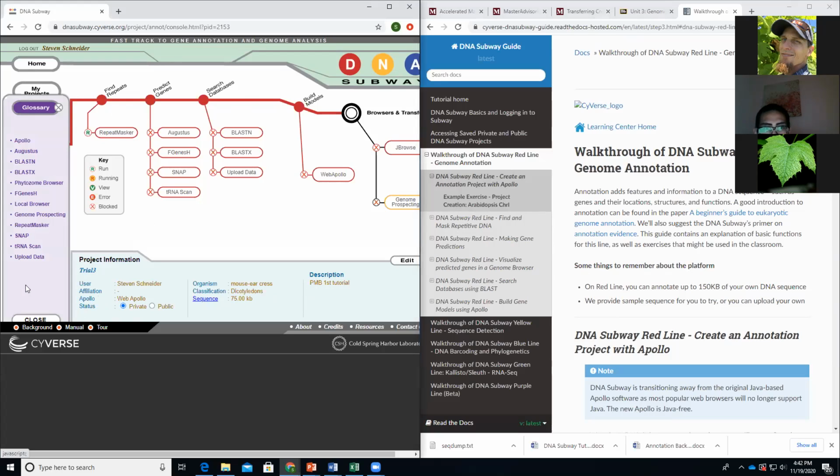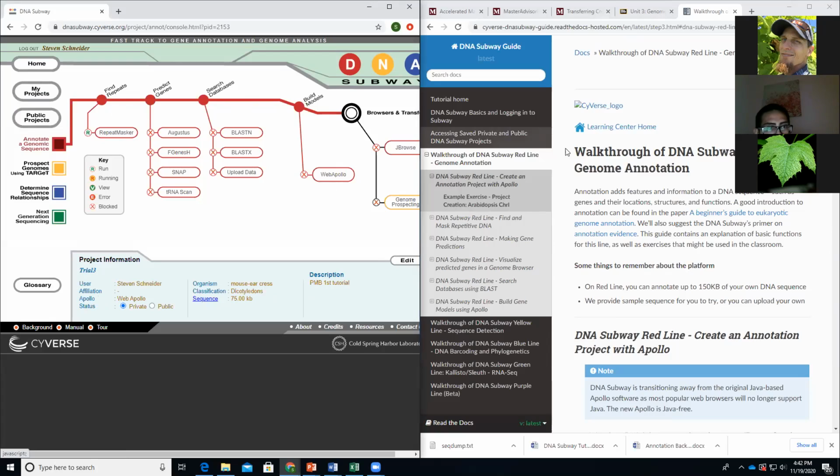Hey, you got a glossary here. Okay, then. So there's your DNA Subway guide. I believe I've said all I can or will for this section.